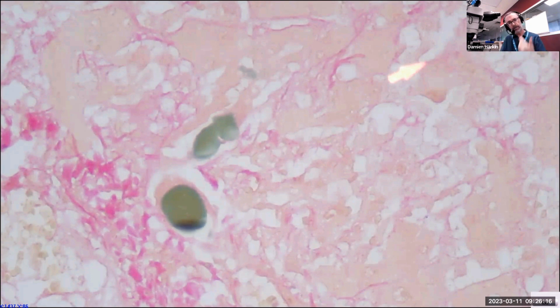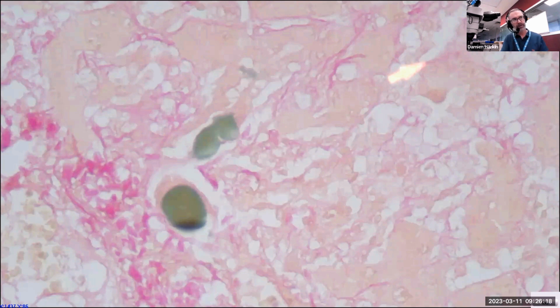And chemically, what we're looking at here is biliverdin. Okay, so biliverdin is originally formed during the breakdown of red blood cells within the body, and then it circulates to the liver, where it can be subsequently converted into bilirubin, which is the more yellow or red color that is stored there. But we can return it through oxidation to this vibrant green biliverdin, and that's what has happened here in this slide.